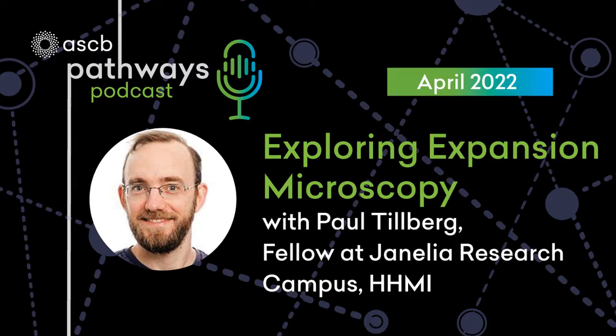So we figured we're not even going to go there. That's not going to be good enough to preserve structure at any length scale if you can see that it's macroscopically deforming. So for the original paper, we basically just chose an intermediate crosslinker concentration that gave us 4x expansion, which felt like enough to be worth trying. And then we would figure out how uniform it really ended up being. So the trick is, can you decrease the crosslinker, but still have a material that's tough and easy to handle?